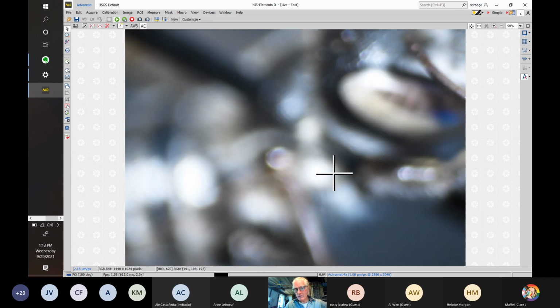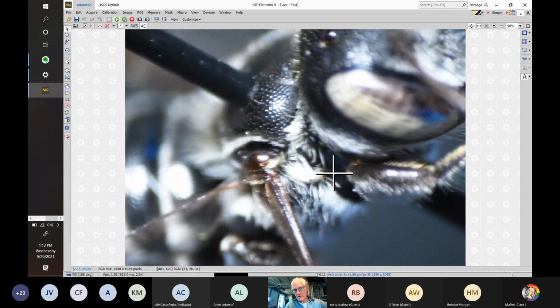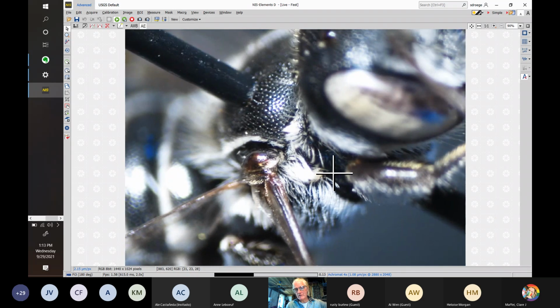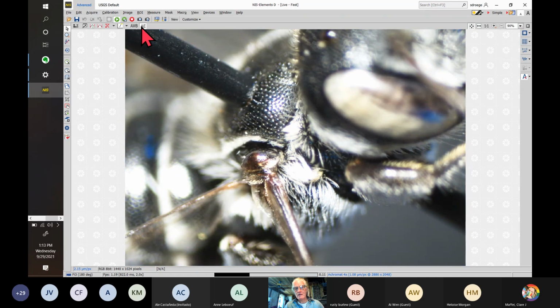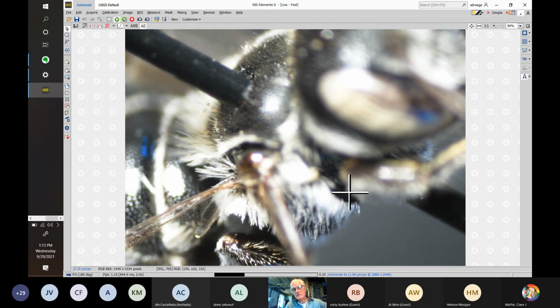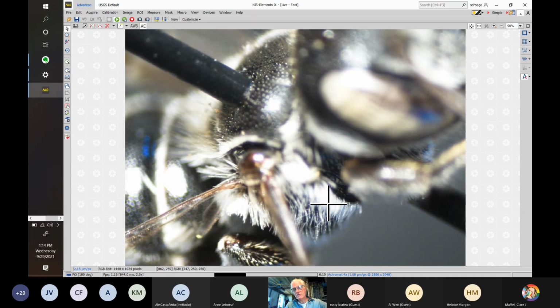I have a female that is also true, and we should be able to see that. So there's a lot of hair here, and I'm not seeing it, let me get the white balance going. I think the important thing is that this face is the anterior face, and this is the side, the lateral face.